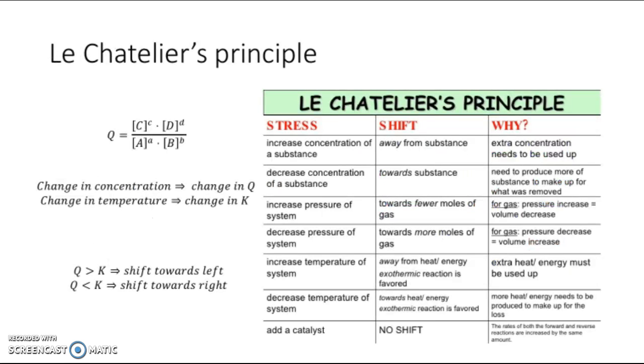Le Chatelier's principle states that upon introducing a stress to a chemical system, the system will shift towards restoring its original state. In general, there are four different ways of stressing a chemical system. These stresses include introduction of a catalyst, change in temperature, concentration, and lastly pressure. But in our experiment, we're only going to focus on the stresses involving temperature change and change in concentration.